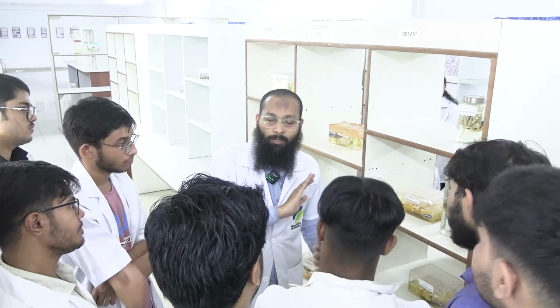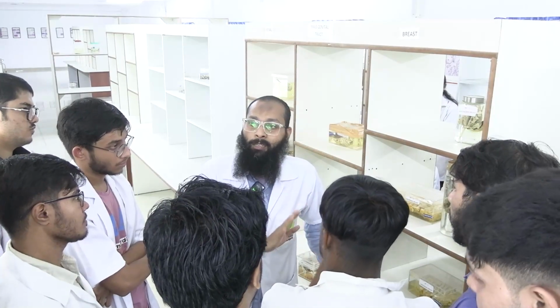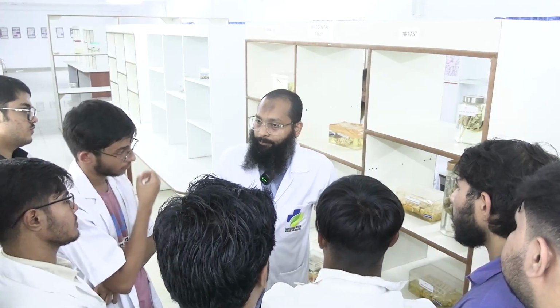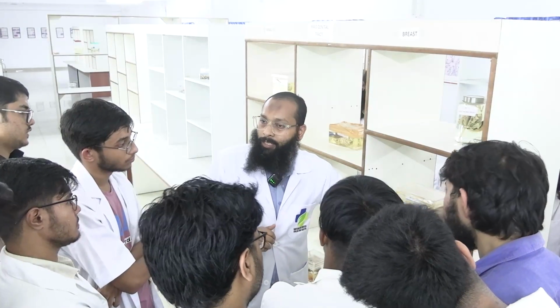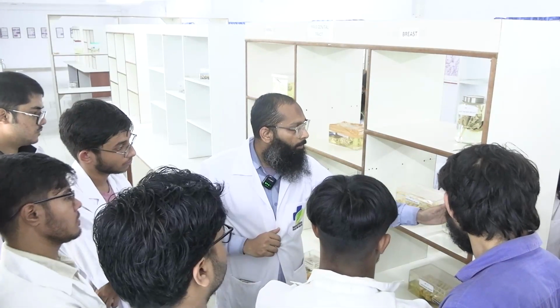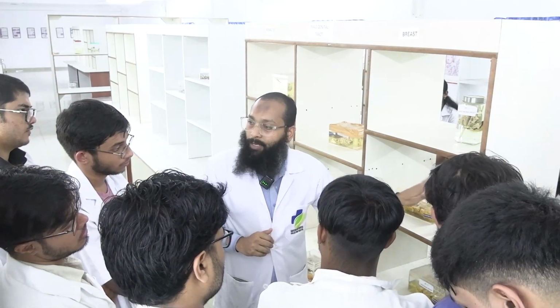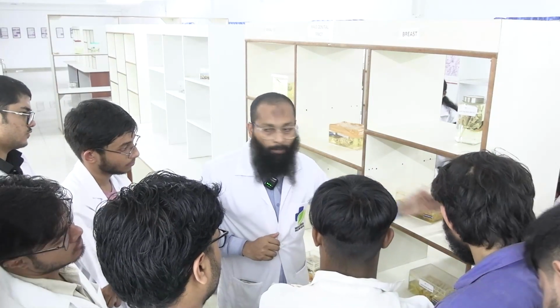And this margin is not important only for the breast specimen. This is important for every surgical specimen that is operated for any carcinoma. So one section we take from each of the margins: distal resection margin, superior resection margin, inferior resection margin, medial resection margin, lateral resection margin. We give one section each.